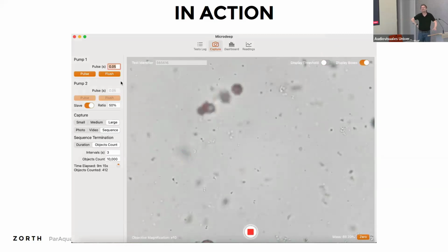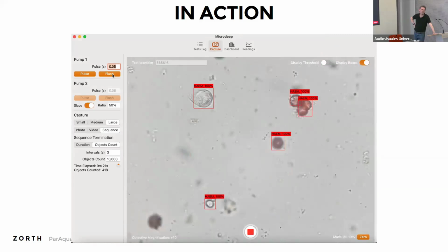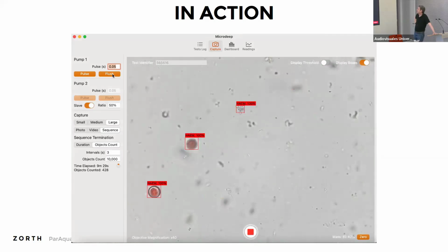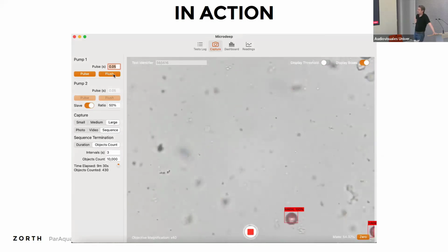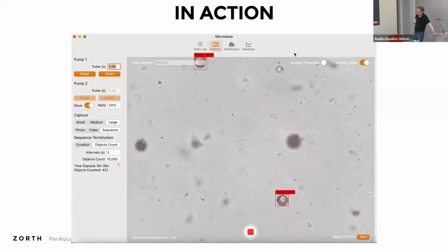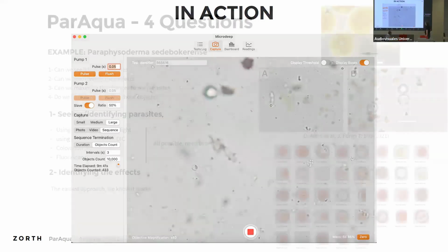It took me 4 hours to label the data set because they're very similar, all that you see. 4 hours to label the data set, 3 hours to train, 7 hours the customer has the model in his machine. Really, you can train anything. And actually, I'm looking forward to going to the lab with you guys so that I can get more data for my personal enjoyment.